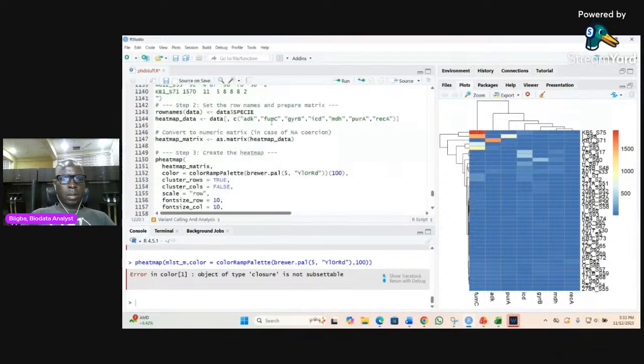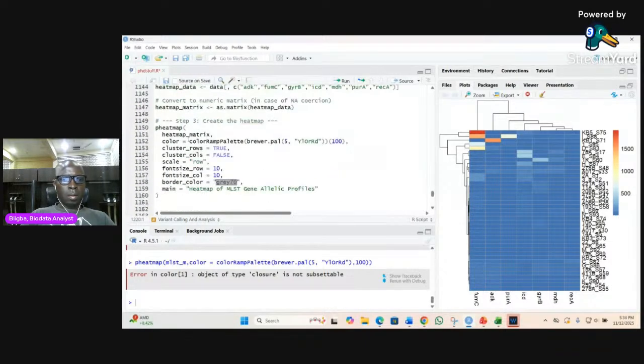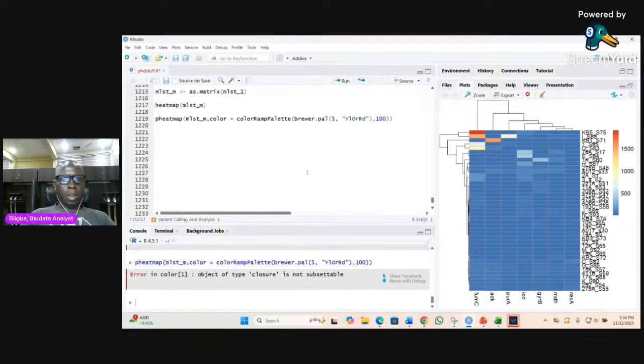It's not today. So yeah, I will simply come here, delete this, delete that, paste it over there, and let's see if the code works.